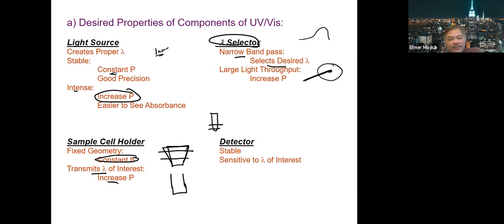Now the detector, just like the light source, should be stable. And most importantly, it is sensitive to the wavelength of interest. And we're going to discuss each one of them.